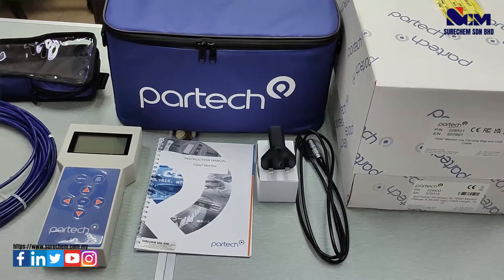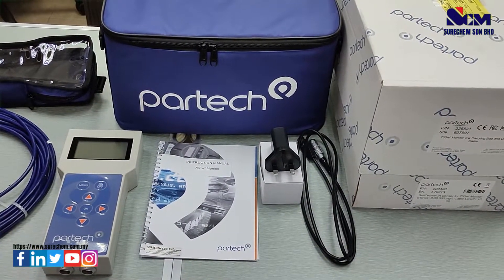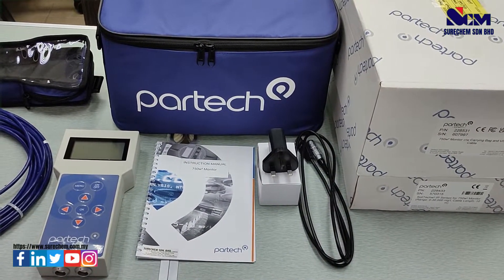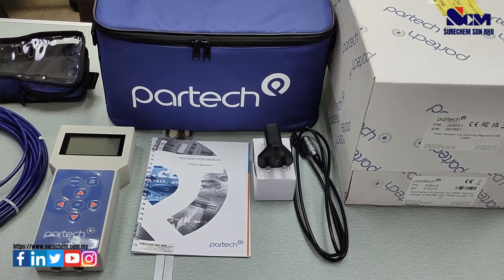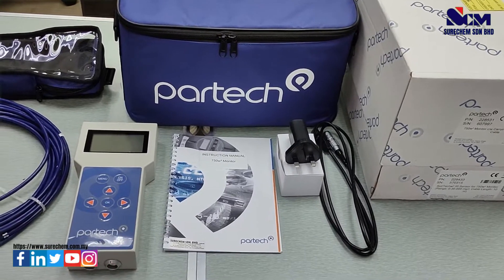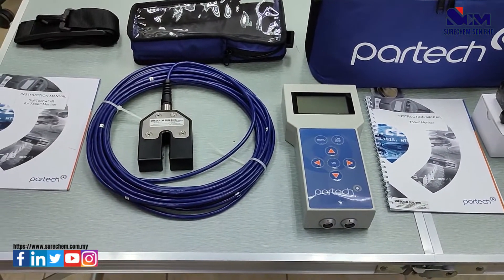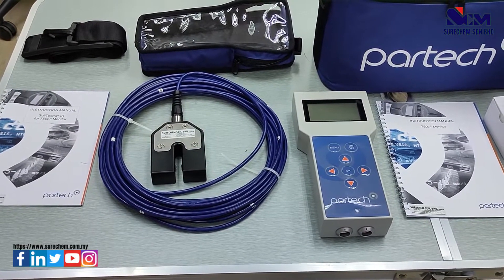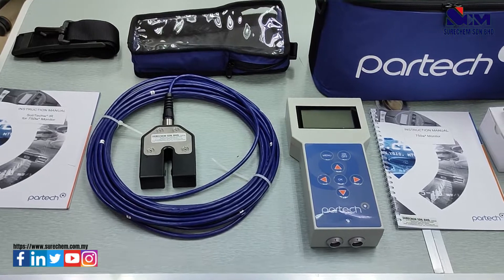Inside the package there is a charging cable, a power adapter, an instruction manual for the 750W2 monitor, the monitor itself with a carrying case, the sensor with a range of 0–30,000 mg per liter, a manual, a protective case, and a strap.